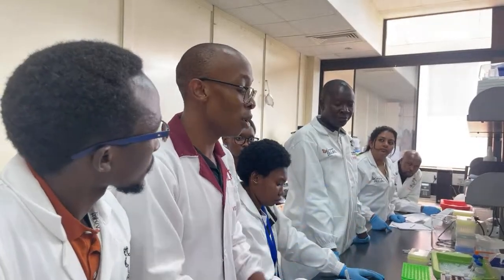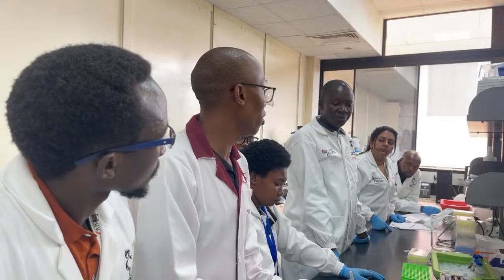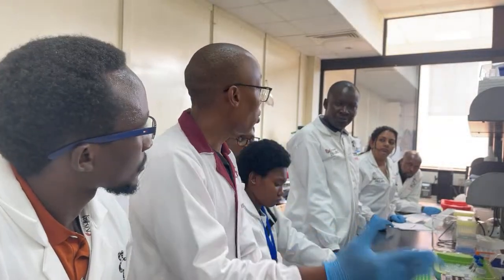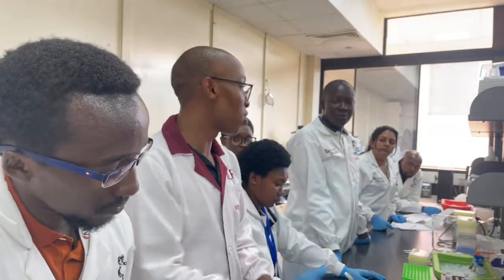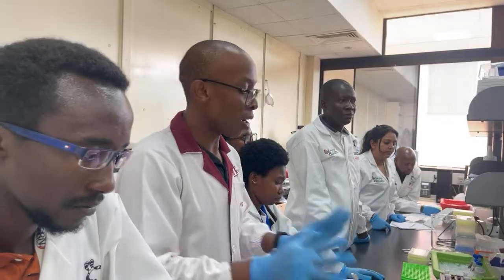The human genome at 30 times coverage, on the Sequel II, is probably between 3 and 4 SMRT Cells to achieve 90 gigs, and that comes with its own cost. But on the Revio, that's just one SMRT Cell. So for coverage, you need to be mindful what organism it is, and whether you need to multiplex or not.